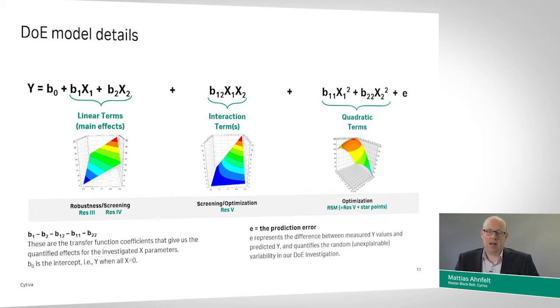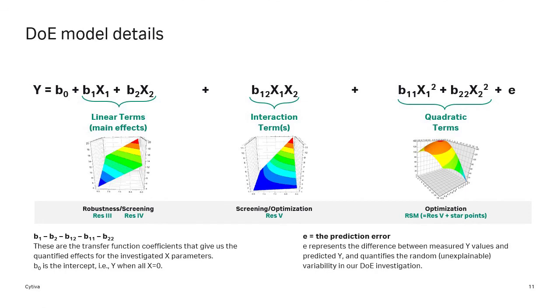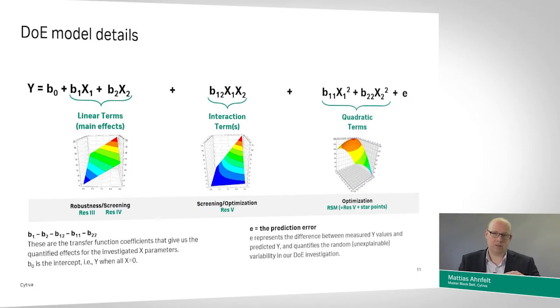Adding one more level of complexity would be to go to the middle cartoon, the middle response surface, which adds an interaction effect between the two process inputs, the two x's. So if we look carefully at the middle response surface, you see that in the front end of the picture, you can go from left to right and all the time be in the blue region. The height of the response surface, or the color, that's the response we get from the system. So we have more or less the same value of our response, no matter if we go from left to right in our x1 parameter.